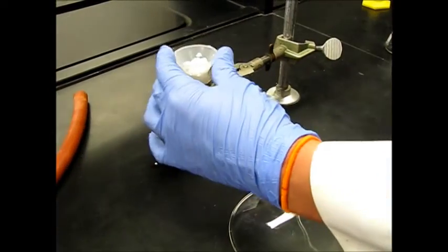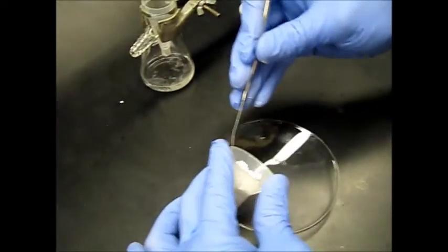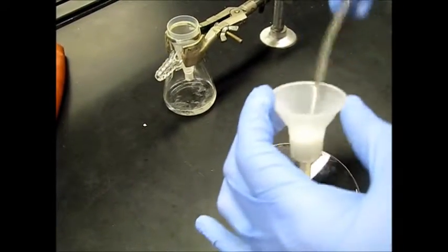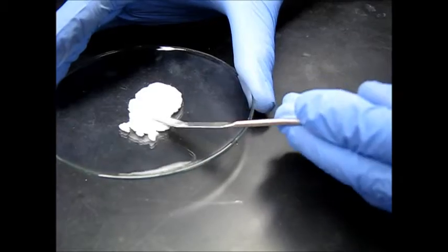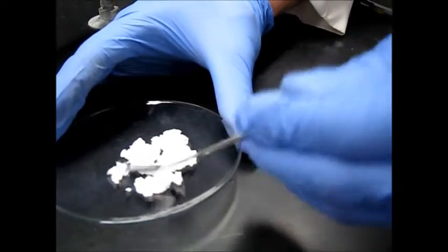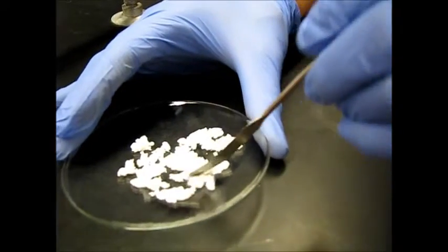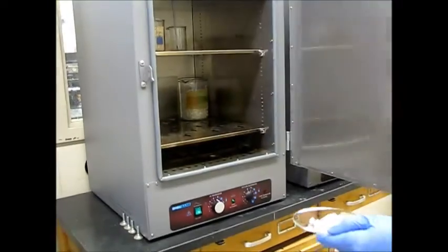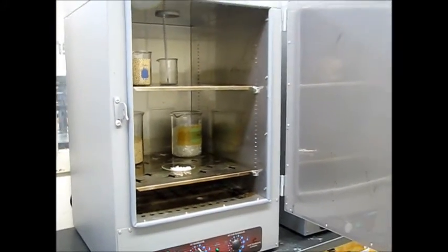So now we're going to go ahead and transfer our product onto this watch glass, which we've already weighed out. Scoop it out. So we're going to set this into the oven. It's not going to dry super efficiently like this, so we're going to press it out a little bit, just to help it dry once it's in the oven. So we'll leave this in the oven for about 10 minutes or so. We're just going to place our product right here in this bottom row, leave it there for about 10 minutes, and we'll come back and check on it and get a good mass.